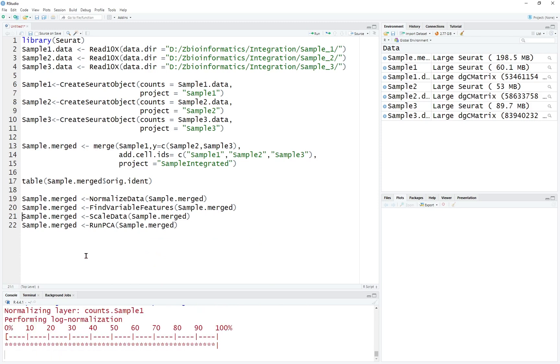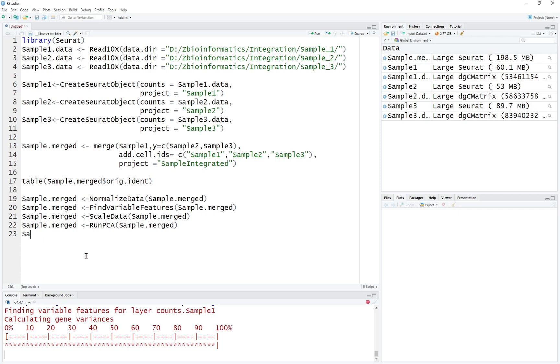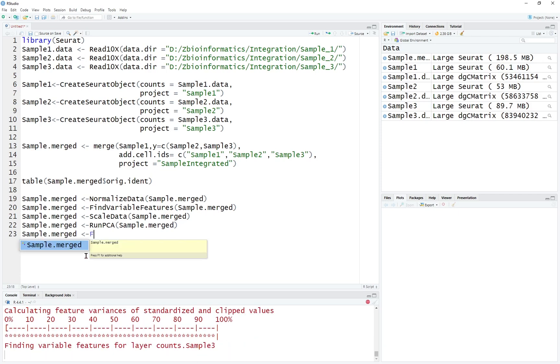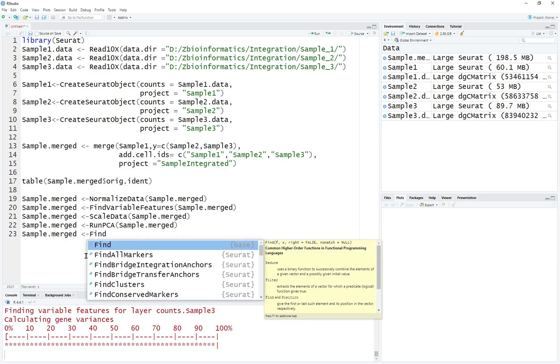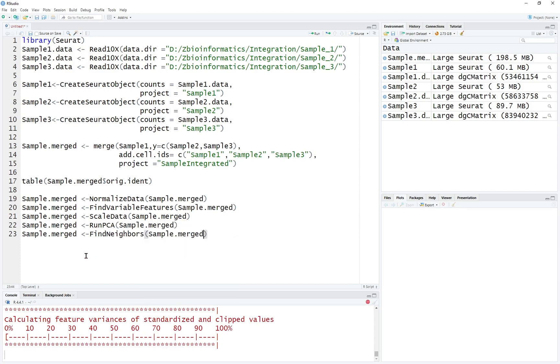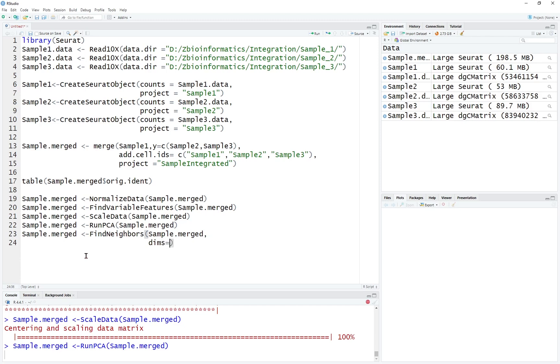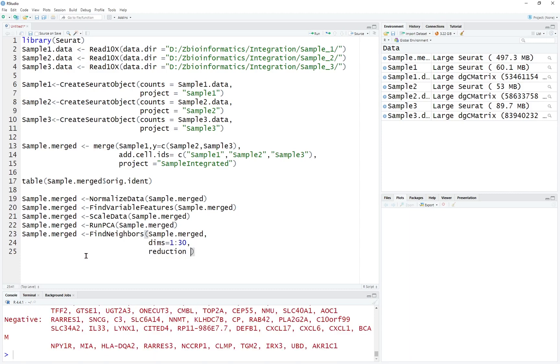Let's execute these lines. We're going to find the neighbors for sample merged — FindNeighbors on sample merged. We're going to decide the dimensions; for now we can use 1 to 30. You can test other dimensional selections as well. The reduction method is going to be PCA.